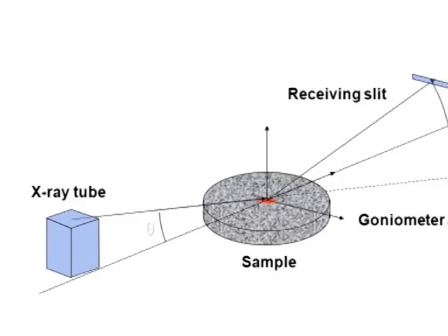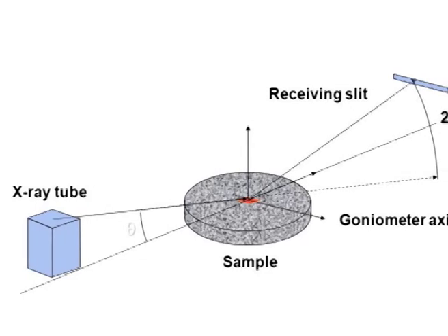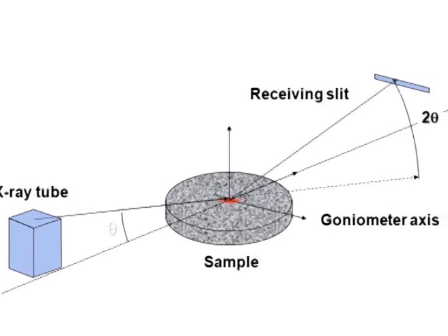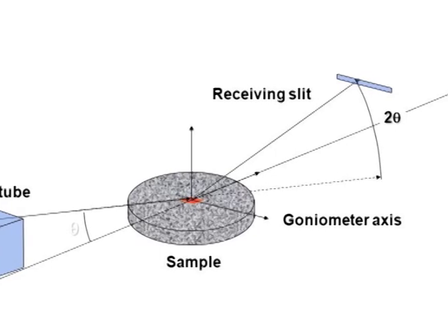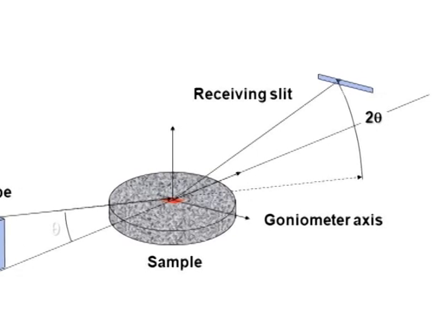we would expect to find all angles where diffraction has occurred, and each of these angles would be associated with a different atomic spacing. A crystalline powder sample will diffract X-rays, but since the orientations of the individual crystals are random, the data set produced is a plot of intensity versus diffraction angle, or Bragg angle theta.